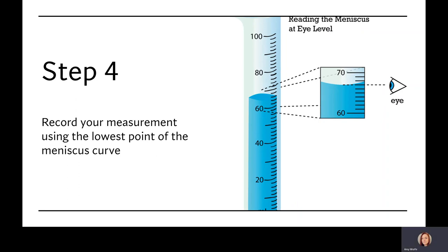The fourth step is to take the liquid measurement at the very bottom of the dip in the surface of the liquid. This dip is called the meniscus. It forms because the liquid molecules are more attracted to the glass or plastic than they are to each other.